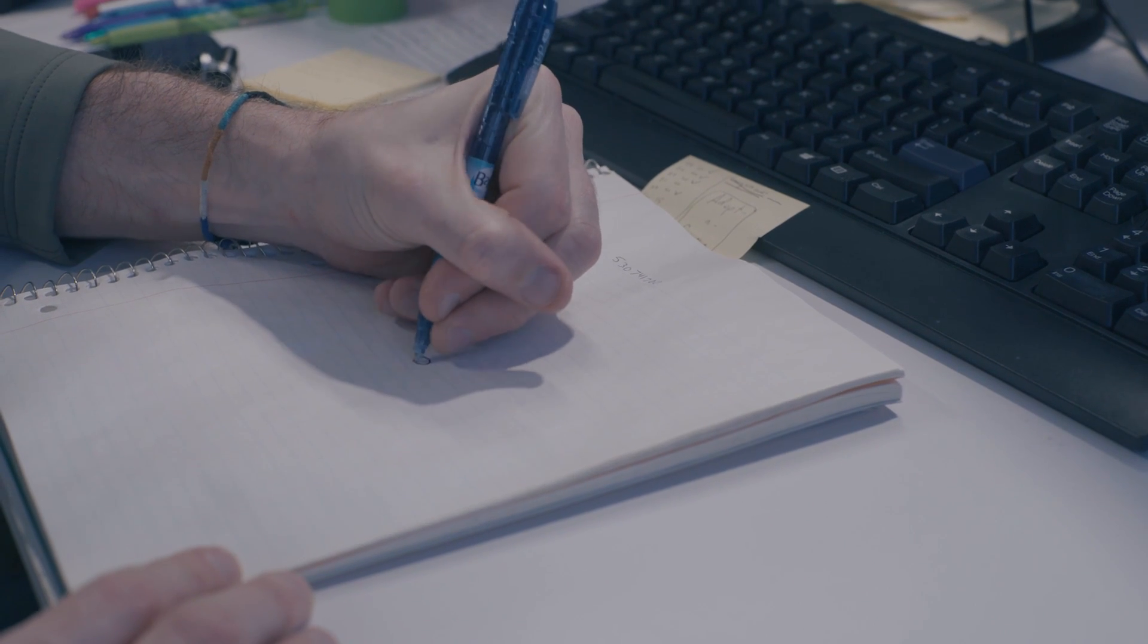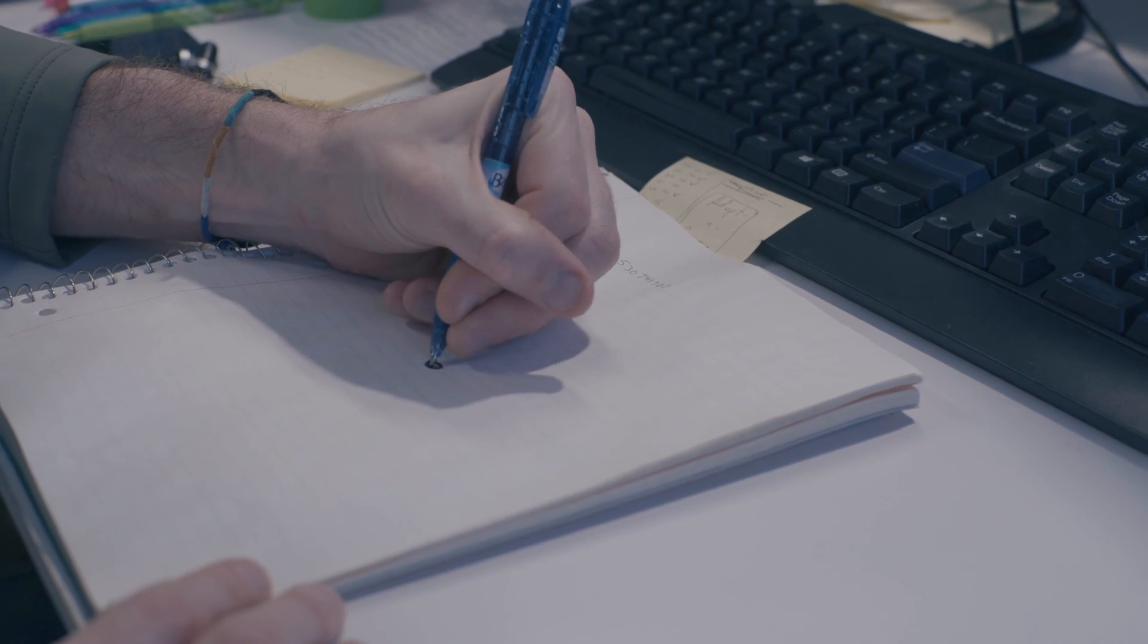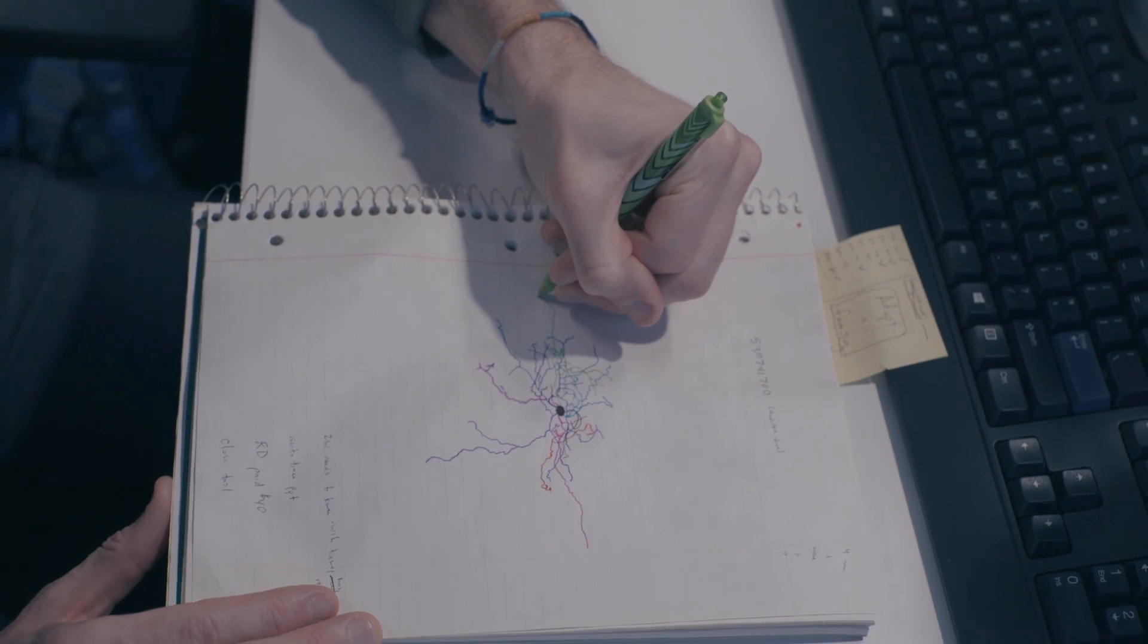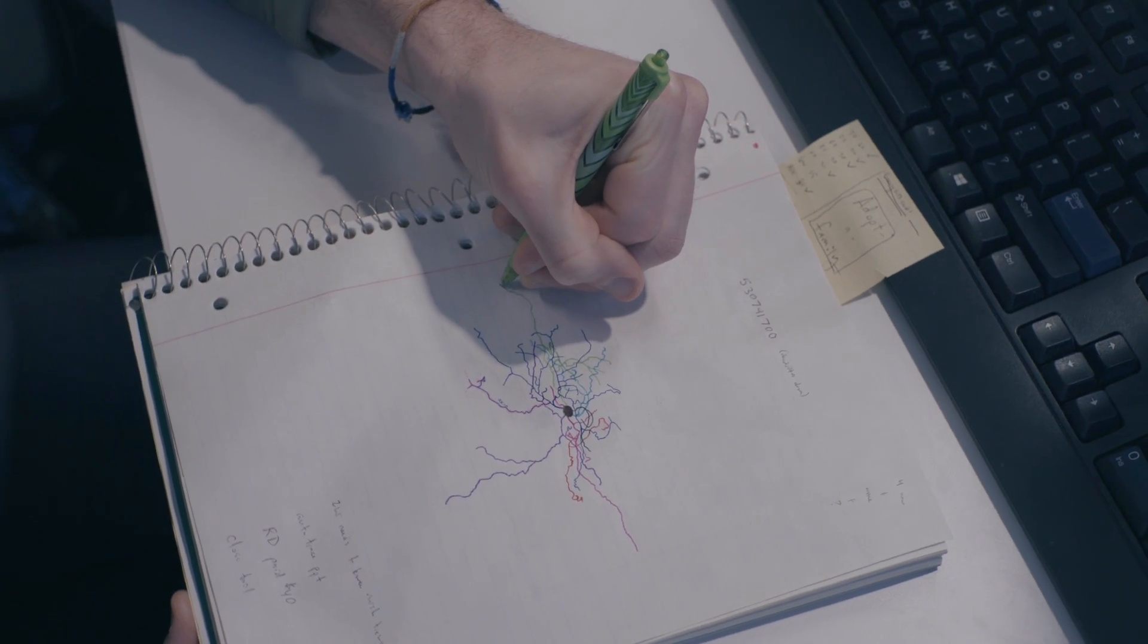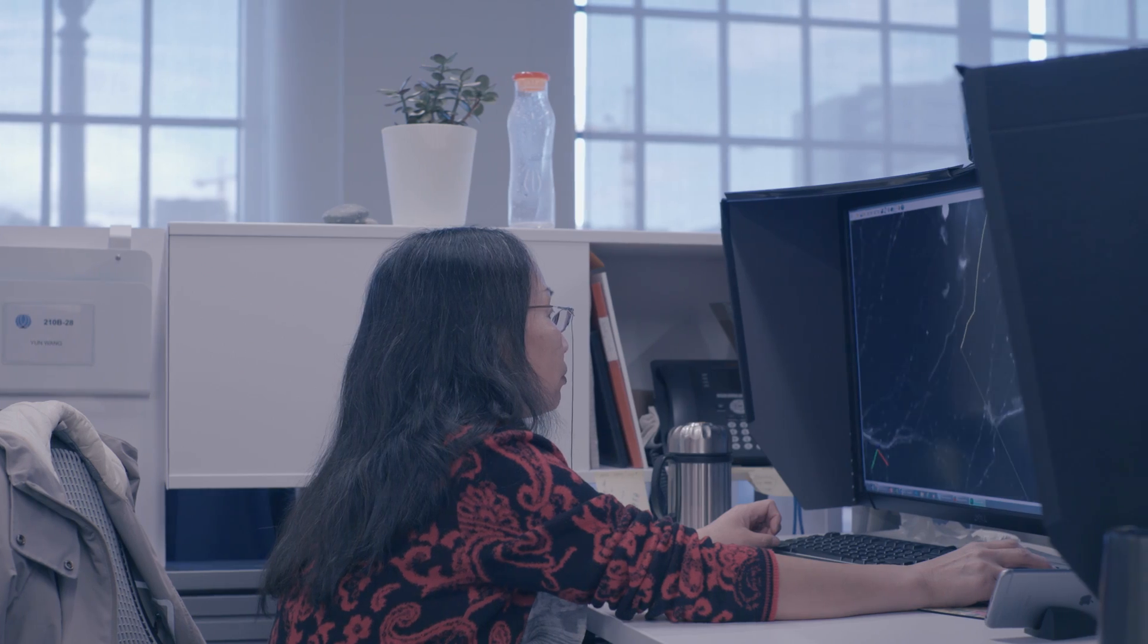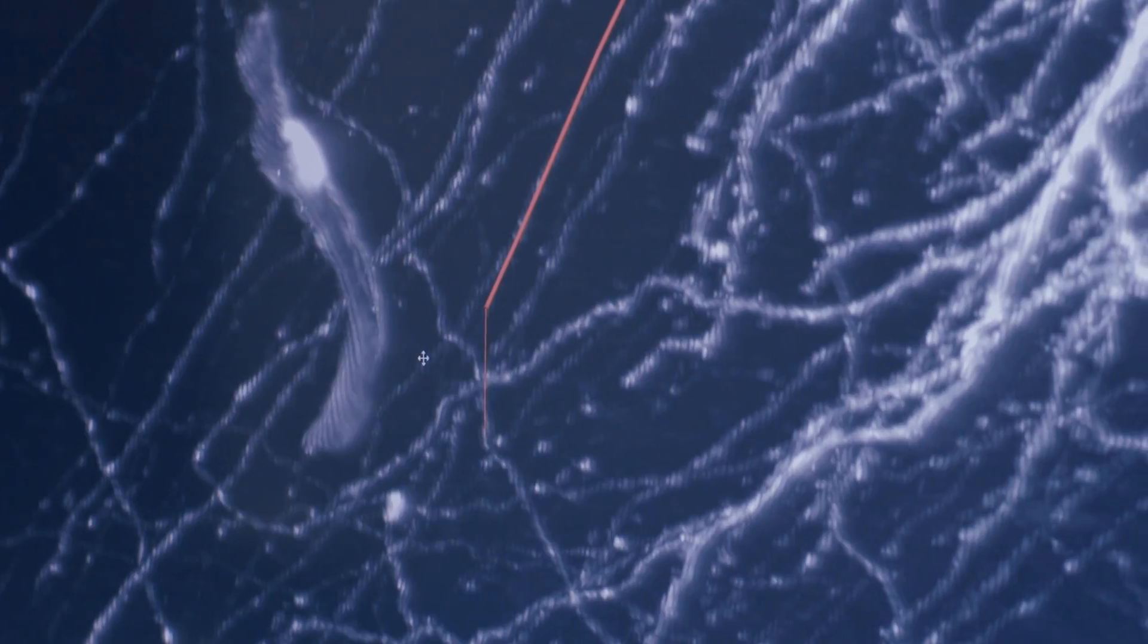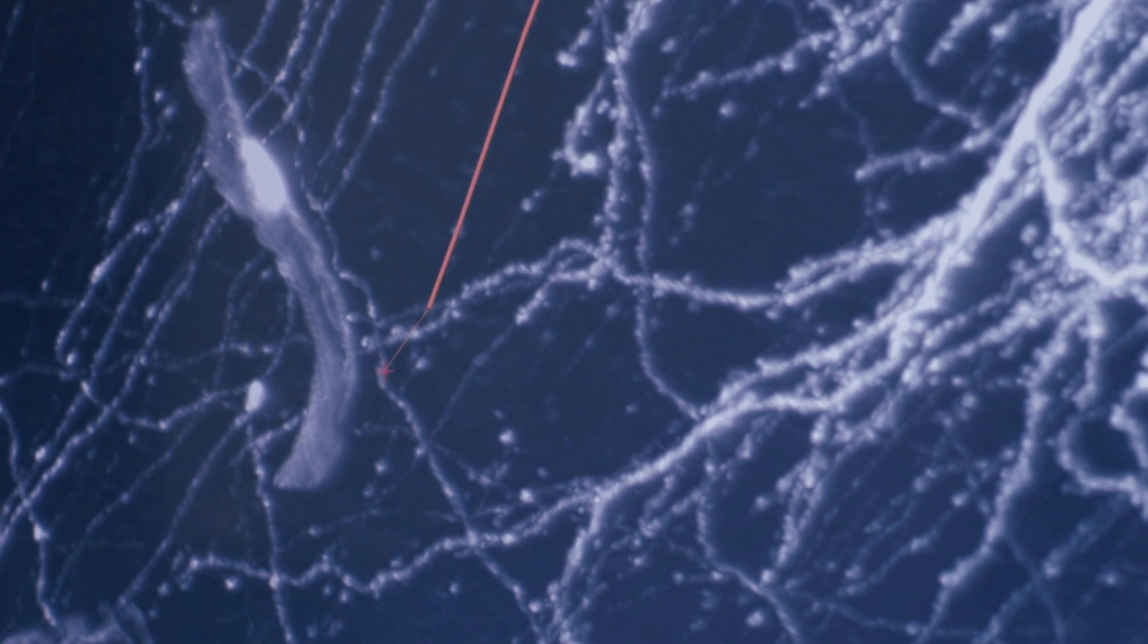The most traditional way to describe neuron morphology has been to draw them. We used to do it by hand just using pen and paper, and now we take a high-resolution image and then use software to draw them in a digital environment.